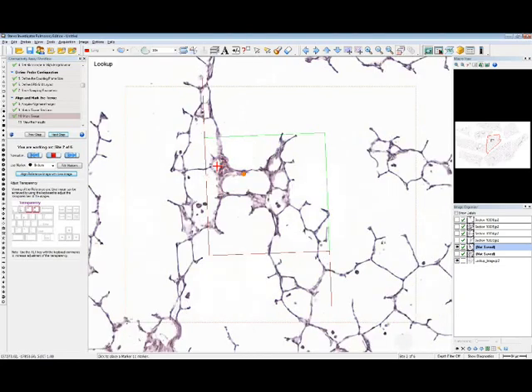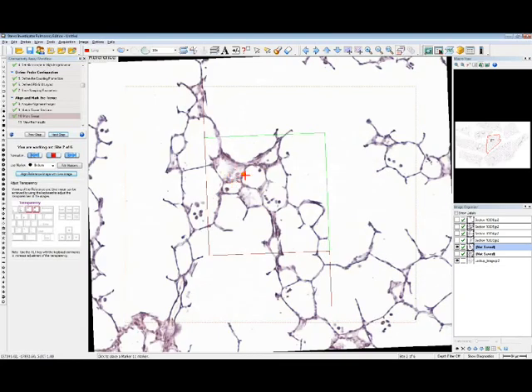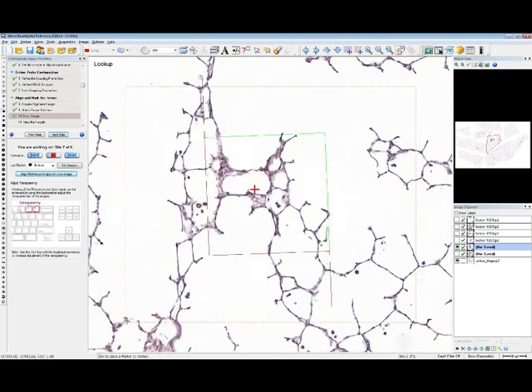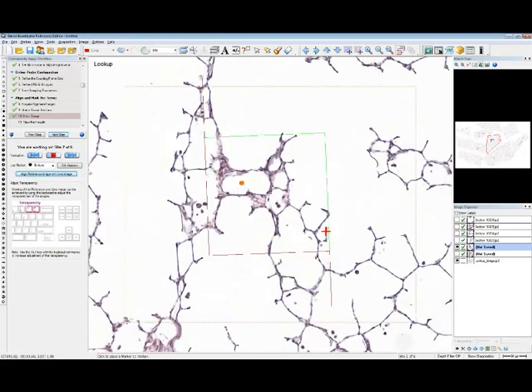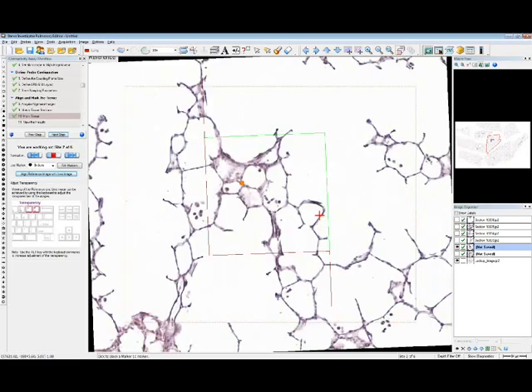We had this one structure that moved through. And actually, you can see this structure over here on the left-hand side has become larger. So this bridge actually was not needed to be counted. So I can easily erase that. And I can double check again. And we'll see, but we do have a connection actually over here a little bit lower. So that's one bridge for us to count.